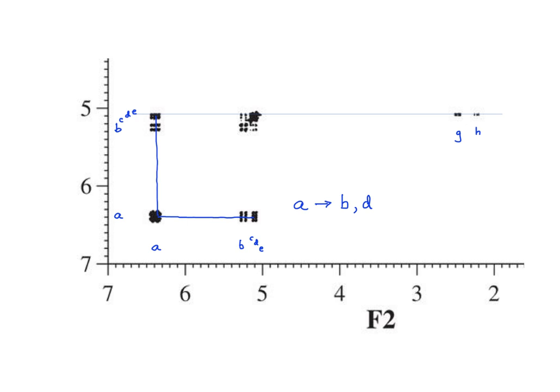We can also see that B correlates with D. This is where having the HMQC data beforehand is valuable. The correlation of proton B with proton D is not surprising because we have already established that both protons B and D are bonded directly to carbon D.